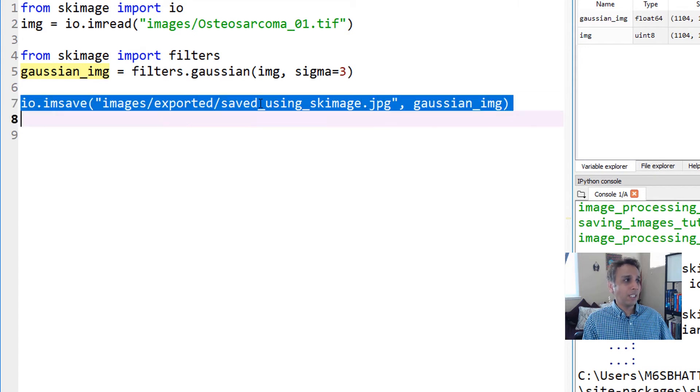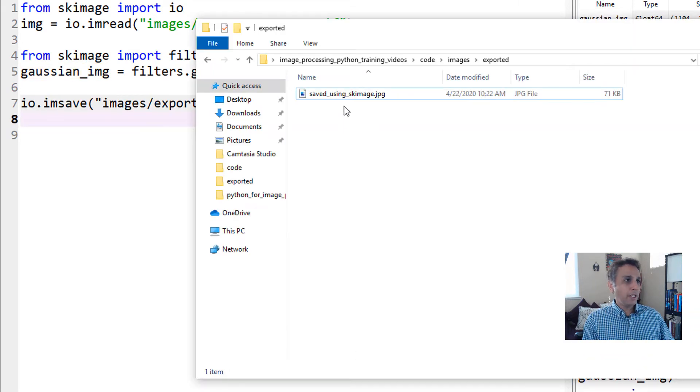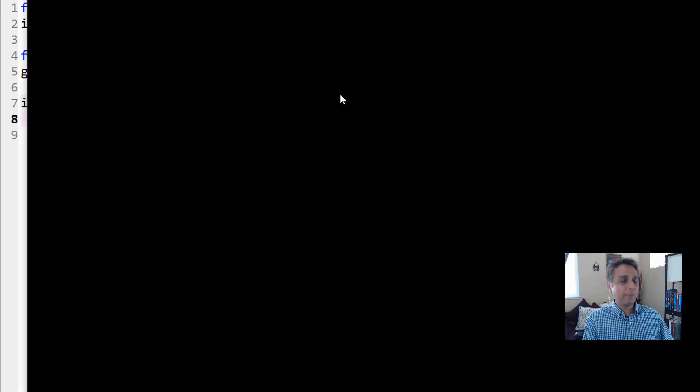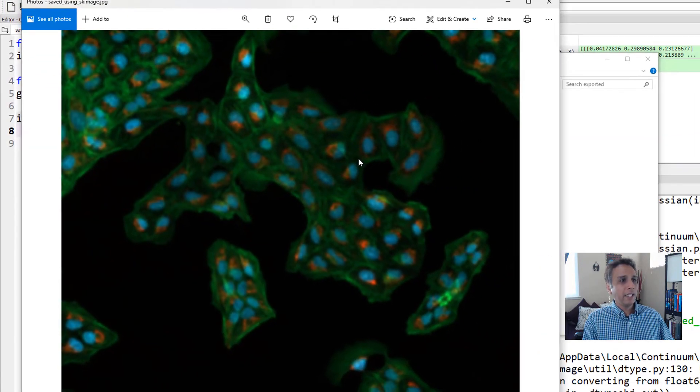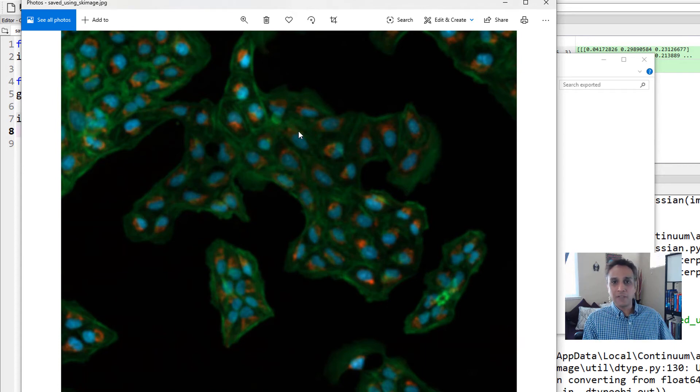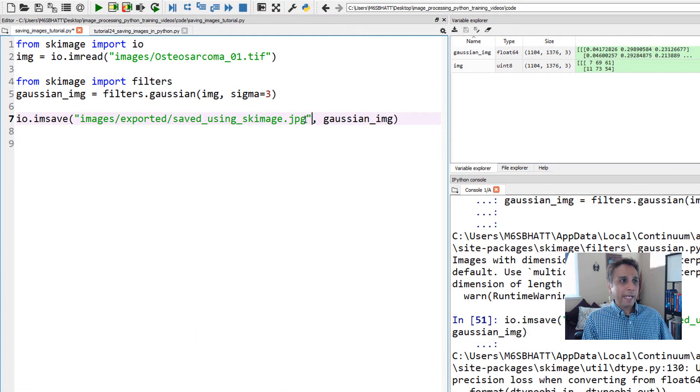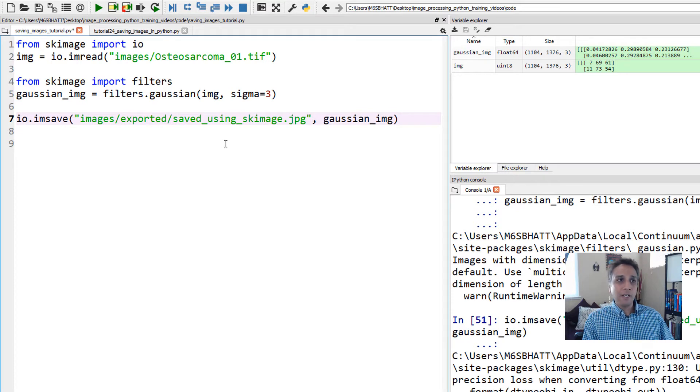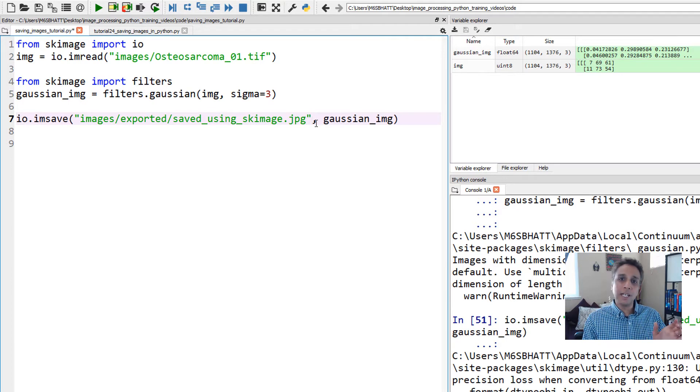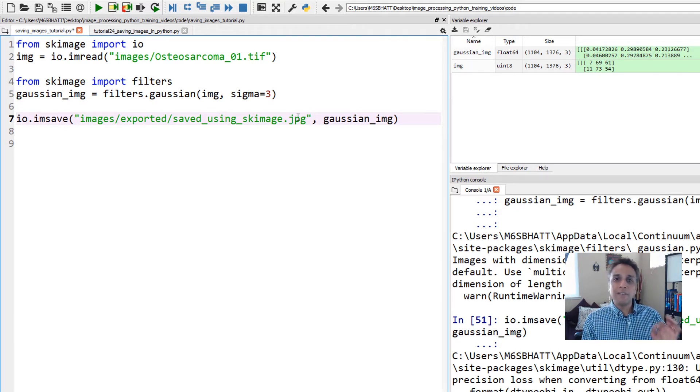Let's run this. When I open the exported folder, there should be a JPEG file. It looks blurred, the colors look fine, everything is fine. That's because in the backend, scikit-image is converting the image from floating 64 to unsigned integer 8. You don't have to do anything when saving images as JPEG.